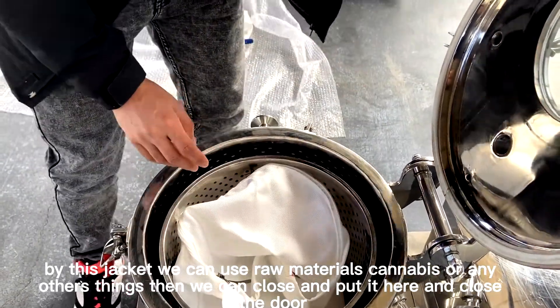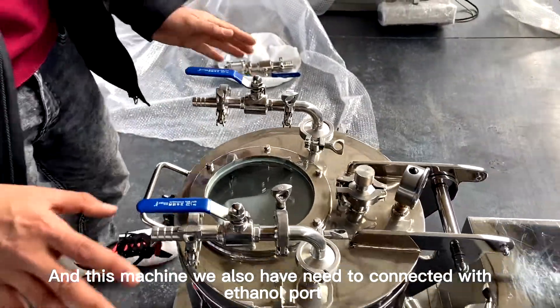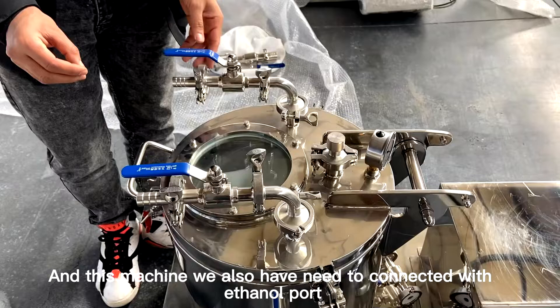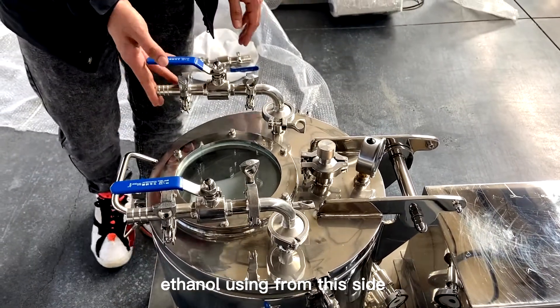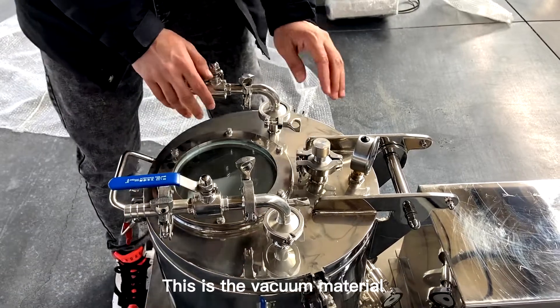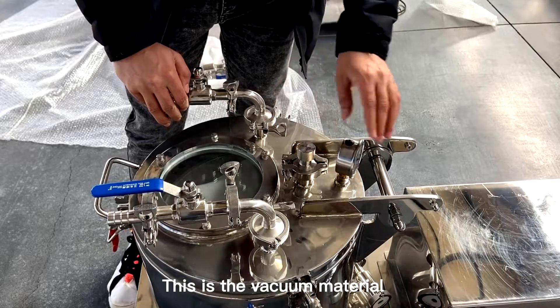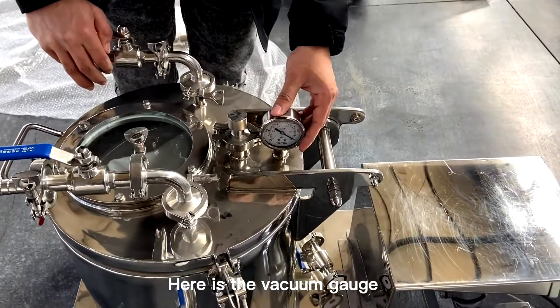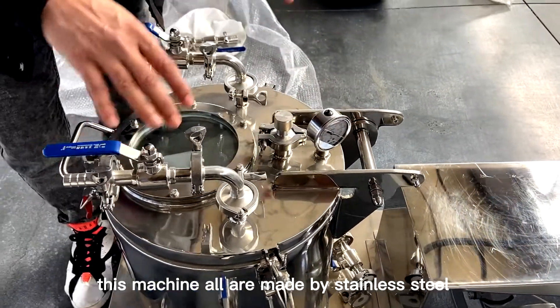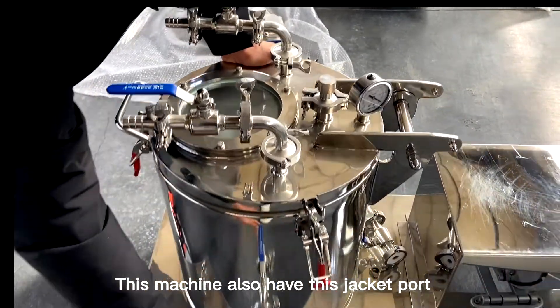You put the material here and close the door. This machine also needs to be connected with ethanol — this is the ethanol port, and we use ethanol from this side. This is the vacuum connecting port, and here is the vacuum gauge. All of these are made by heavy stainless steel.